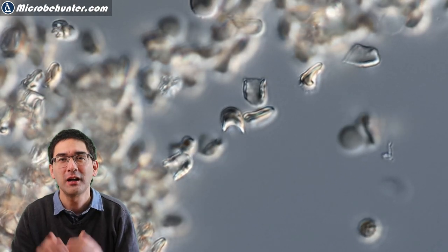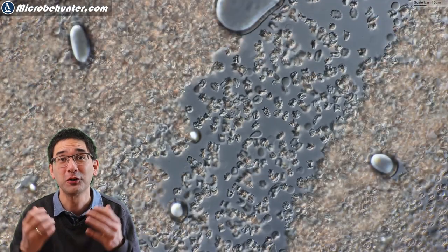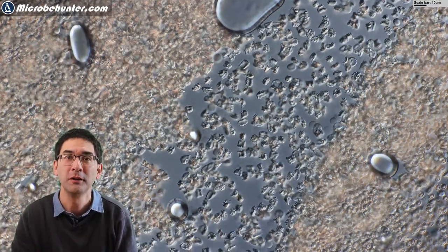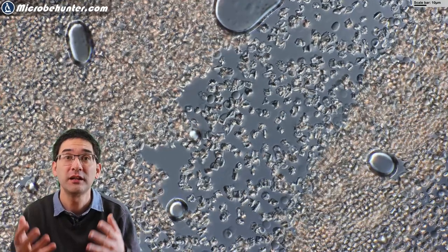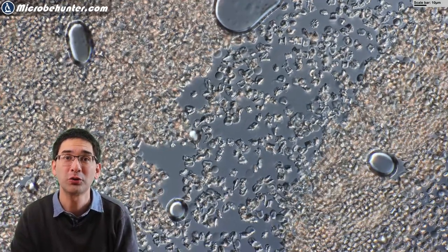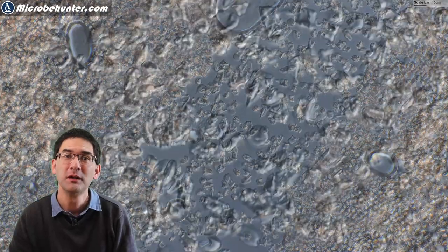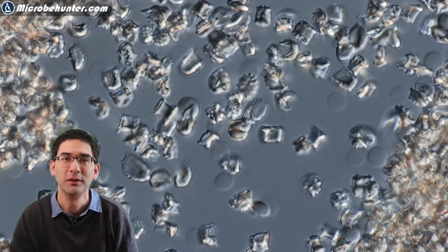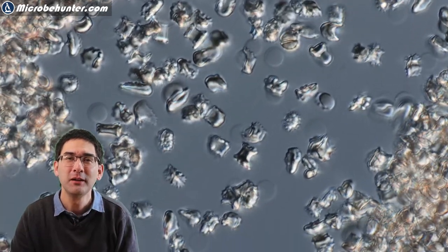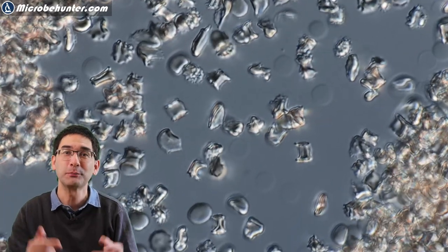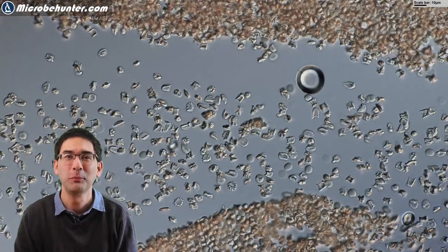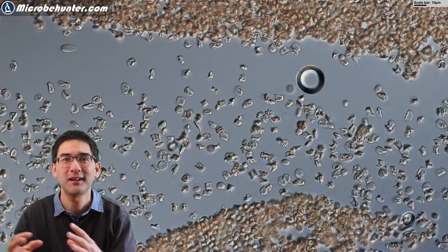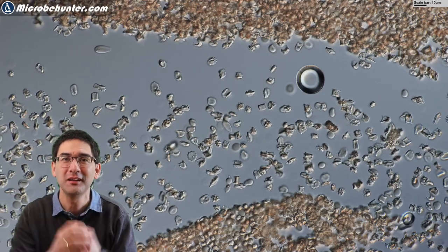But luckily, this is not really a very realistic scenario because normally we do not get so much salt into our blood. But this shows why drinking salt water is not the best thing to do. Here again, you see a little bit of streaming of the red blood cells very irregular right now and very misshapen. Something I did not try is reversing the process. Maybe that's the topic of another video. And here again, there is the streaming of the red blood cells as the salt water and the blood start to mix beneath the cover glass.